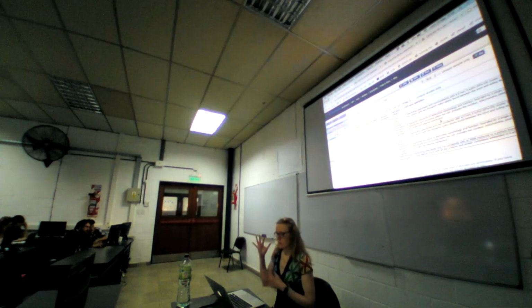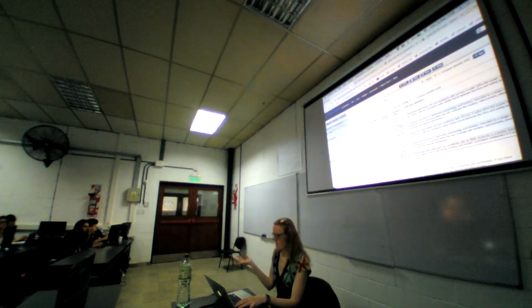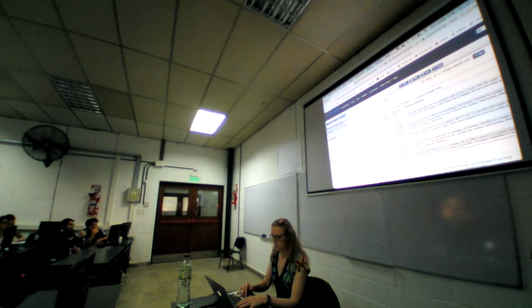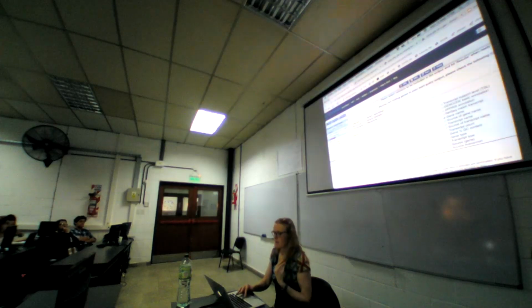So that was the data in table format, and we can now have a look at how we get the sequences for these 6 genes as well. They obviously don't come in table format, they come in FASTA files, but instead of doing all of this again, I will just go back into my attributes in the menu on the left, and then select sequences at the top.